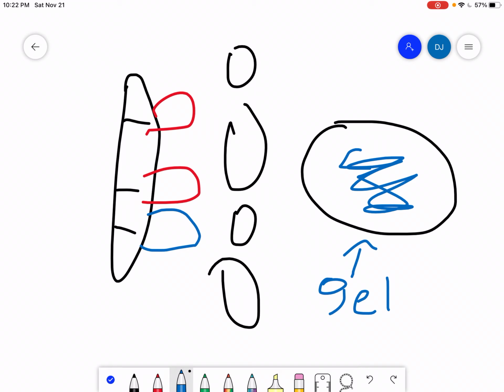But don't really worry. Here we're just focusing on slab gel electrophoresis to create a restriction map. It's more of an overview in this. So basically we need this gel, right? And we're not going to specify which gel we're going to use, okay? We're going to need this gel.